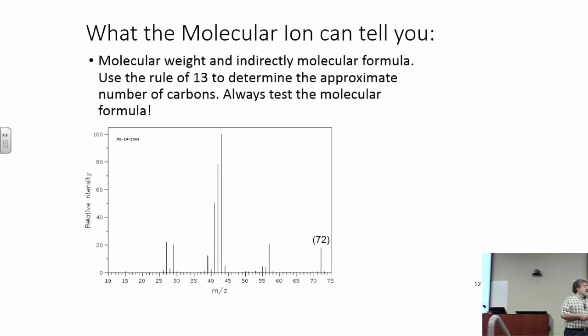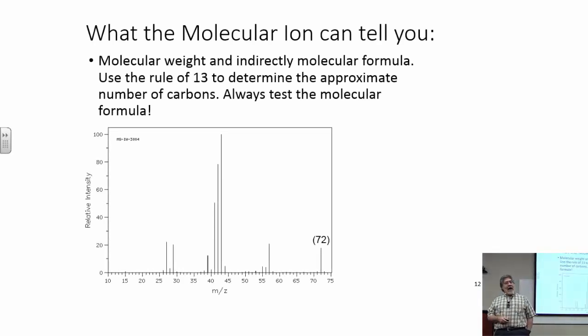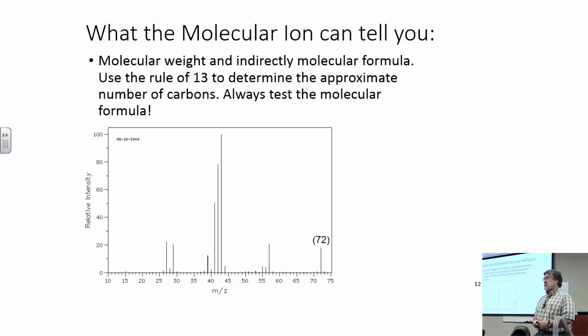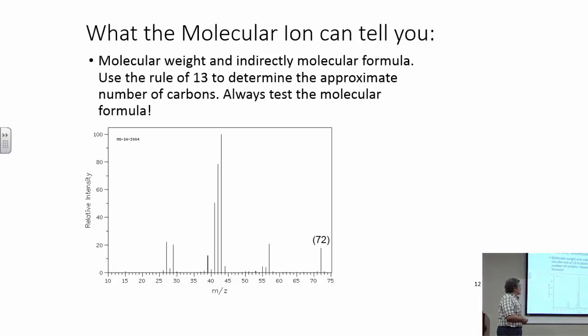Moment, though, I want to ask you a question. How do you deal with this? When you're presented with a mass spectrum of a molecule, how do you turn the data into a molecular formula? That's easy for you guys to do. And there's the answer, right?